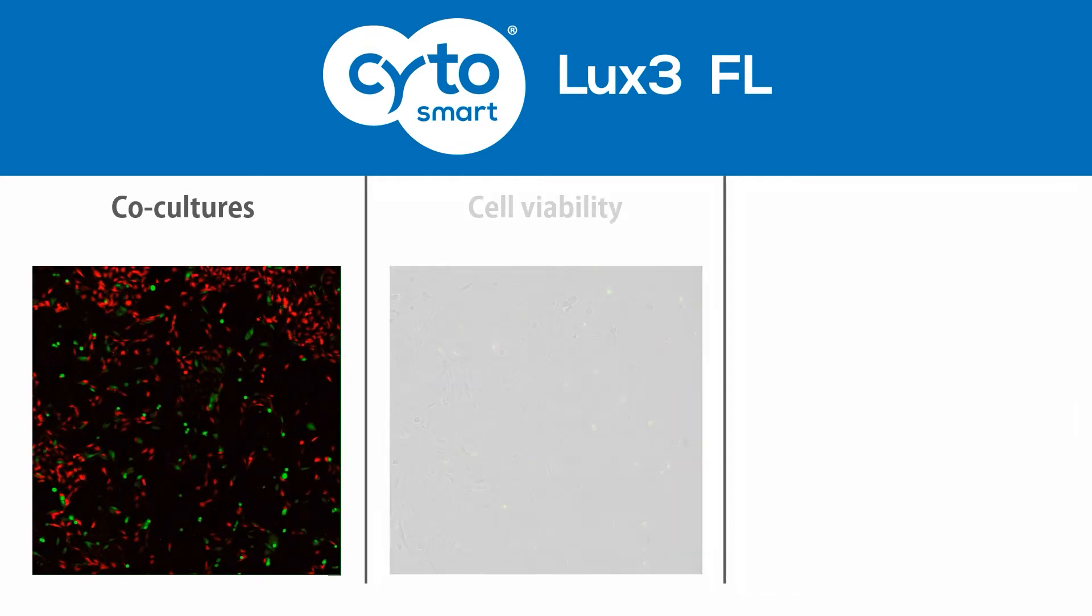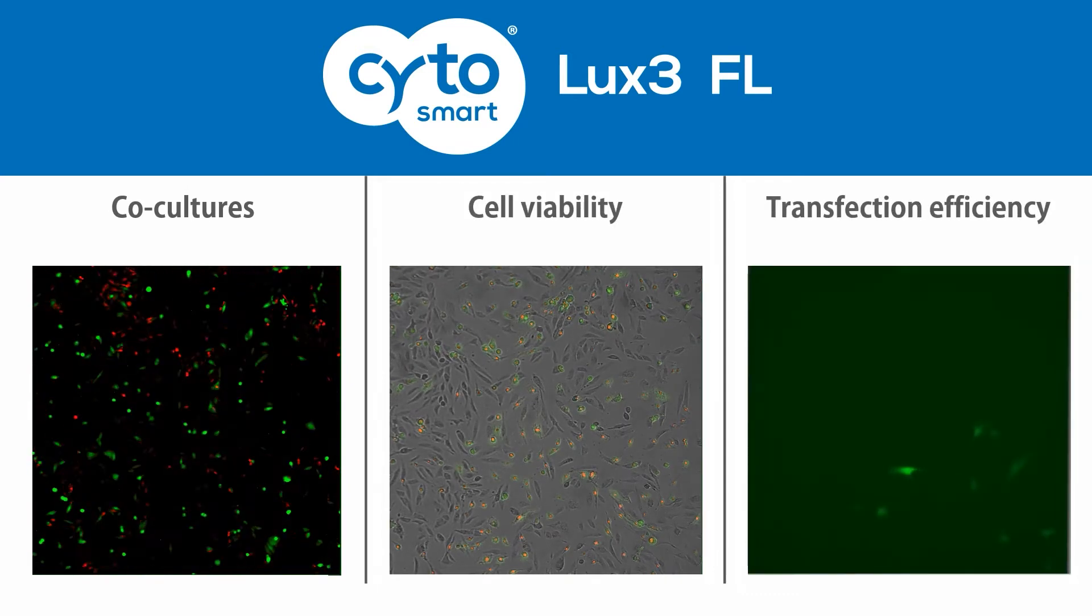The systems are suitable to analyze cell cultures with fluorescently labeled cells, quantify cell viability and transfection efficiency, and more.